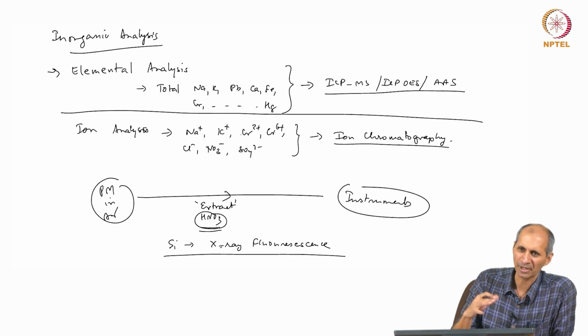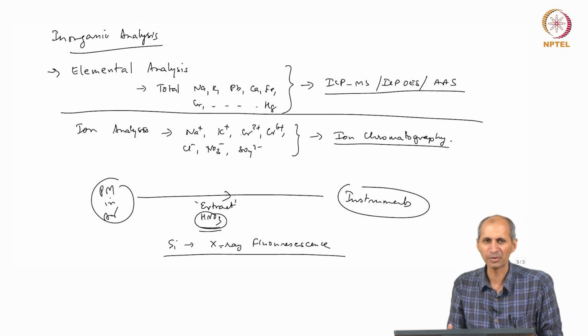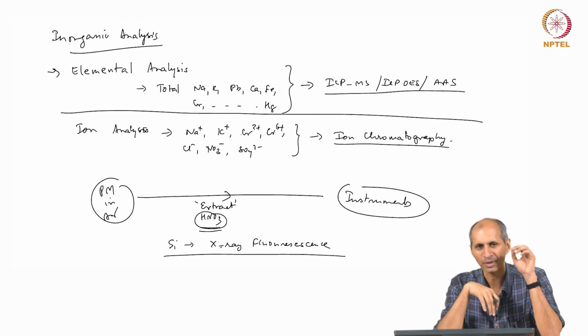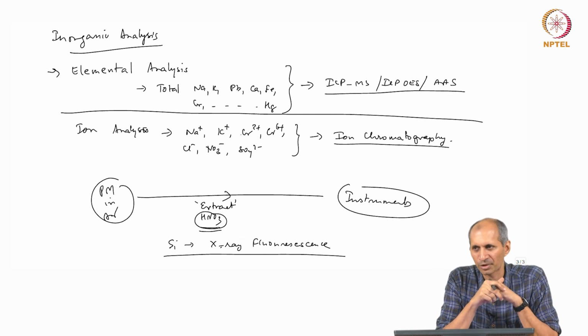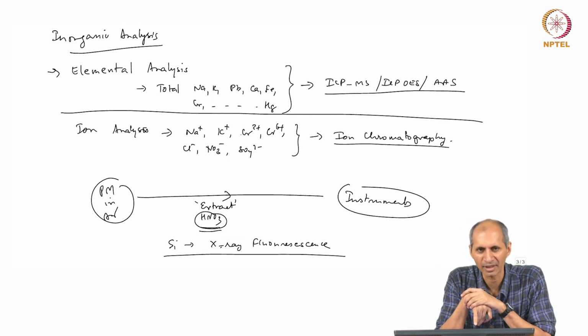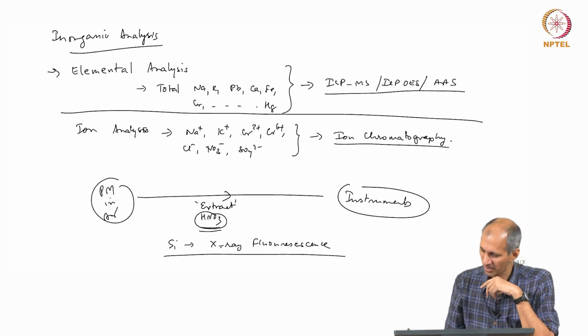It has problems because all spectroscopy have problems. In terms of the extraction method, it is very simple because there is no problem about what is the depth of the sample, everything. It will take away everything, it will remove everything. It is a brute force method. You do not have to be very precise with it and all that.